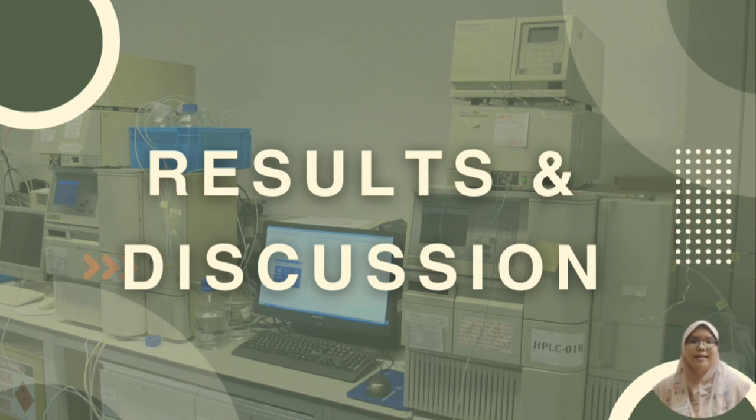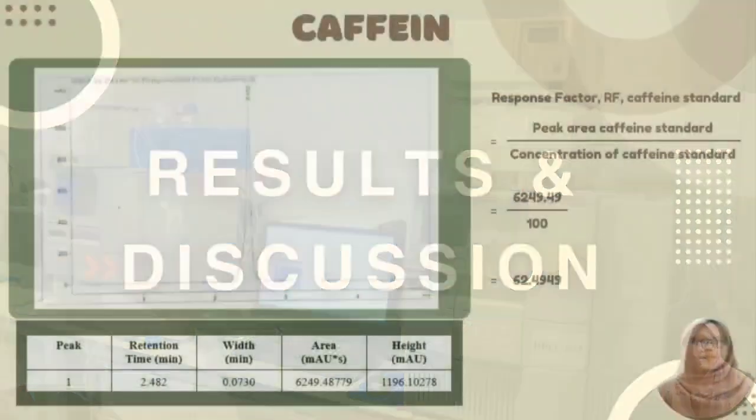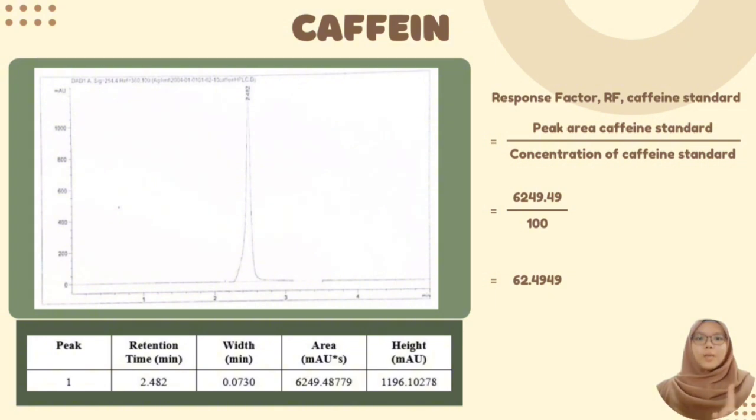In the next few slides, you will be shown the results and calculations of the RF and the concentrations of caffeine in both Coke and Levita drink. Now, let's have a look. Now, I will explain to you about the calculations.